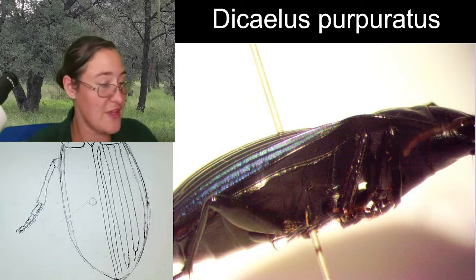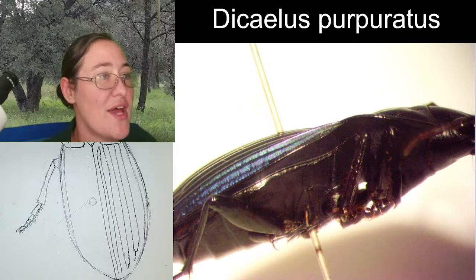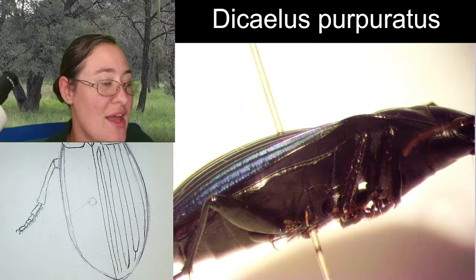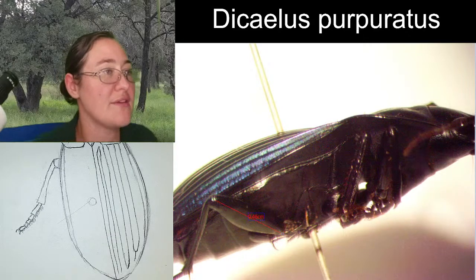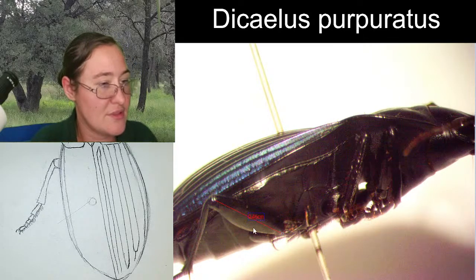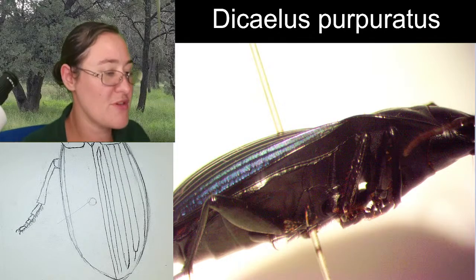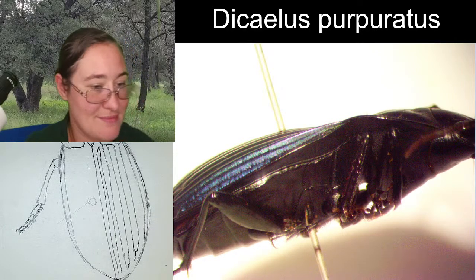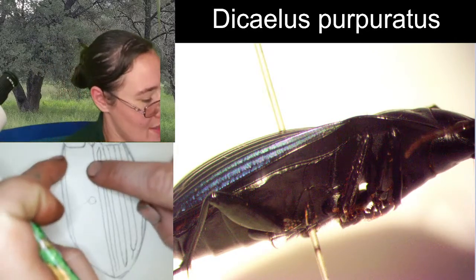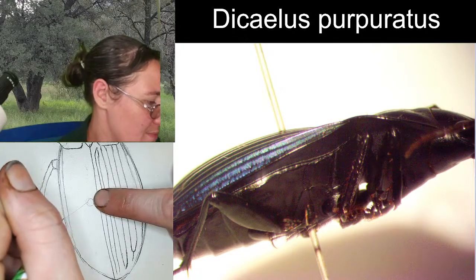And the femur on the hind leg, because I already have a good view of it right here, let's go ahead and measure it. I would guess that the hind femur is longer. Nope, 0.48. All of the femurs are the same size. That's kind of fun. I wonder if that's always the case. It can't be. It's not always the case.